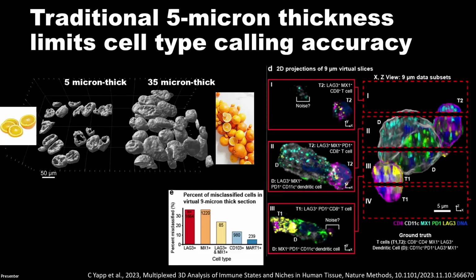In the second section, I get the most accurate composition of markers, but I'm not seeing the third T cell. Now the third case is really interesting because it now looks like the dendritic cell is LAG3 positive, which is contradictory to scientific literature. And when we quantify the misclassification of cell types, it can be as high as a third, depending on the marker.